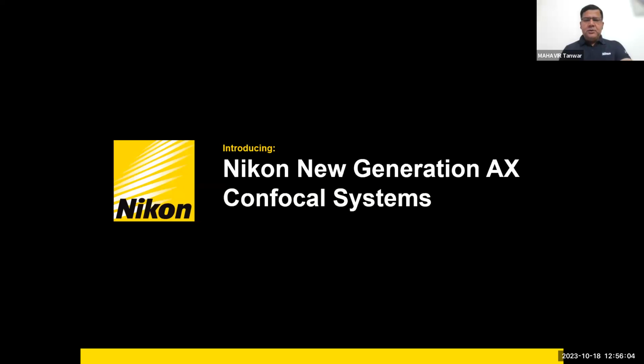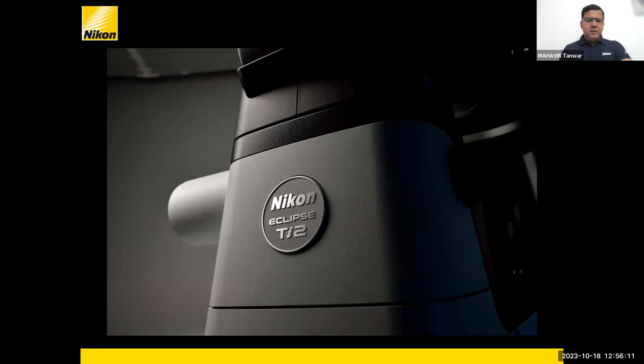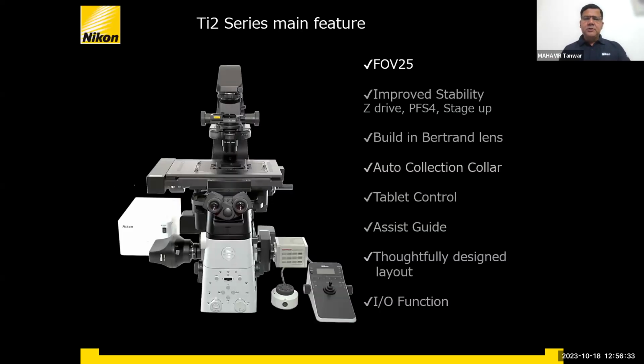So let's understand what is new and why it was introduced. The base of the Nikon confocal will always be an inverted or an upright microscope, depending on the application. The microscope shown here is the inverted microscope, and a microscope is required for any confocal because the confocal scan head will be attached to a microscope. A microscope is a must for any confocal.